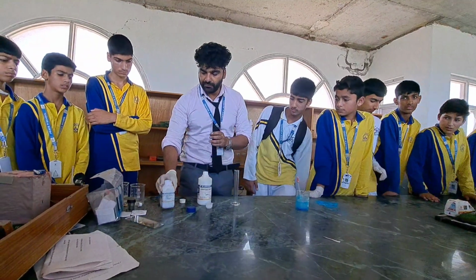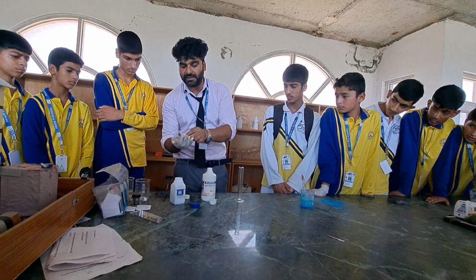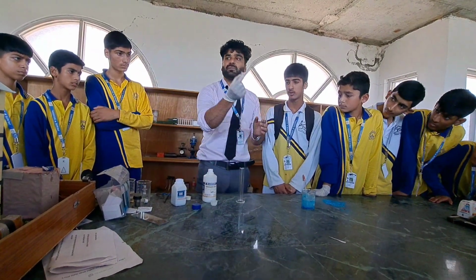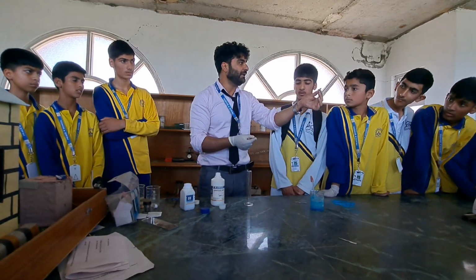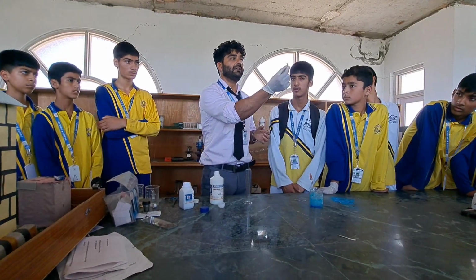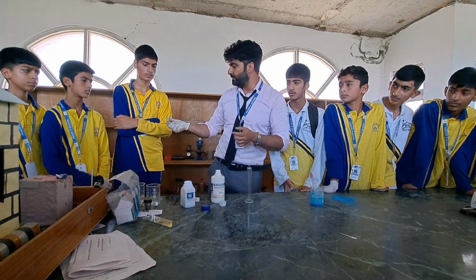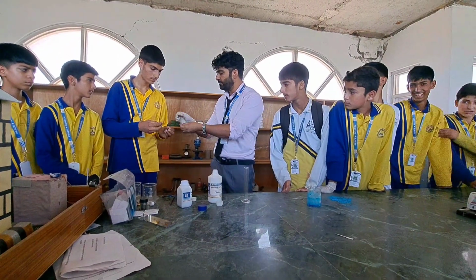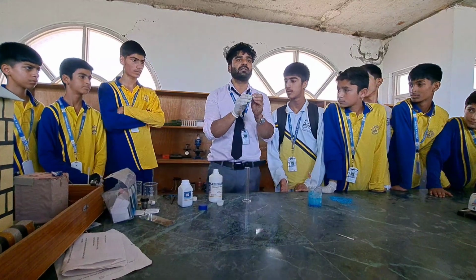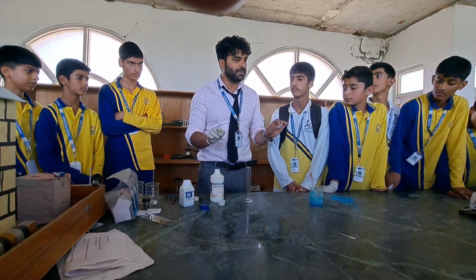And let me tell you, students, these are the flakes. These are called the flakes. These are zinc flakes. ये जिंक है बेटा, ये मेटल है, जिंक मेटल. इसका कलर कैसा है? सिल्वर. दिस इज जिंक मेटल. आप हाथ से देख सकते हो, कोई बच्चा आप देखो इसको, ये है जिंक मेटल. ओके, मेटल है ये जिंक. अच्छा, इसको मैं ट्रीट करूंगा किसके साथ, रिएक्ट करूंगा किसके साथ? सल्फ्यूरिक एसिड के साथ. और रिएक्शन आपके सामने होगी.